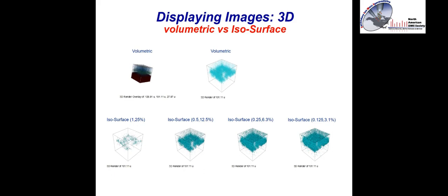The isosurface basically means you're telling it to display a different portion of the data that meets a criteria that you select. So when displaying an isosurface, you need to be very explicit about why you chose a given setting, because you can basically display whatever you want from that data. And so it'd be very easy to force it into what you want to display and not really what the data is showing.